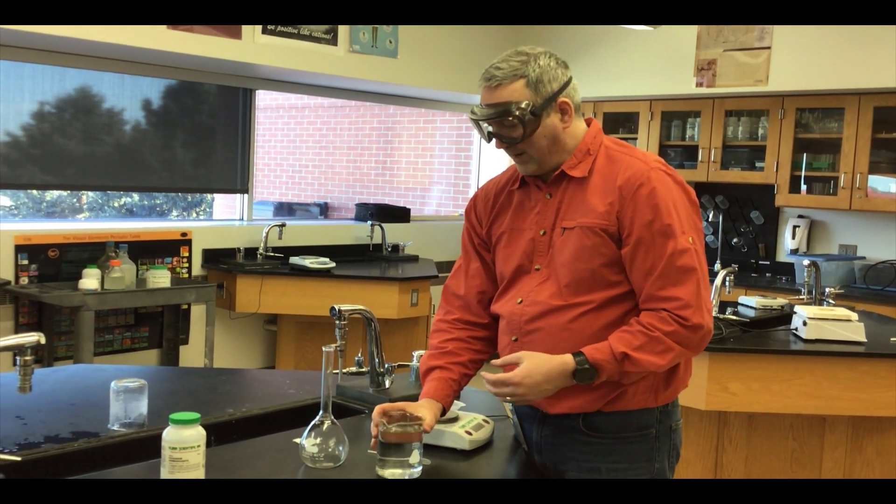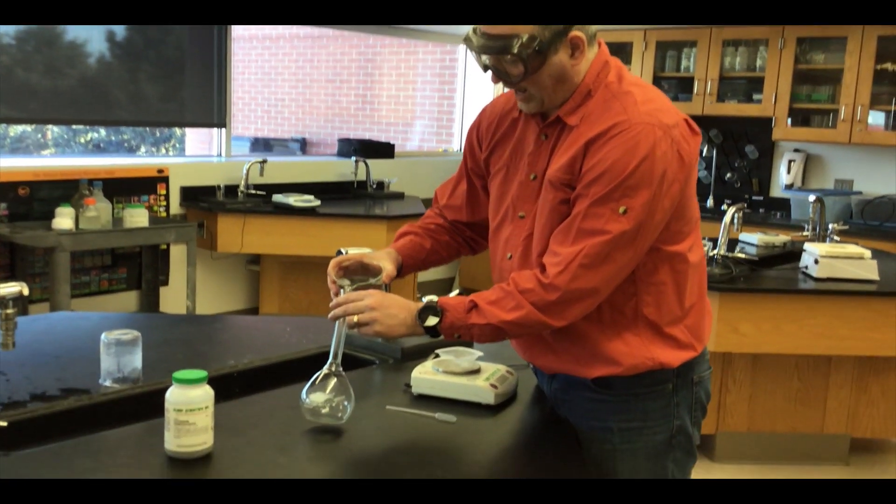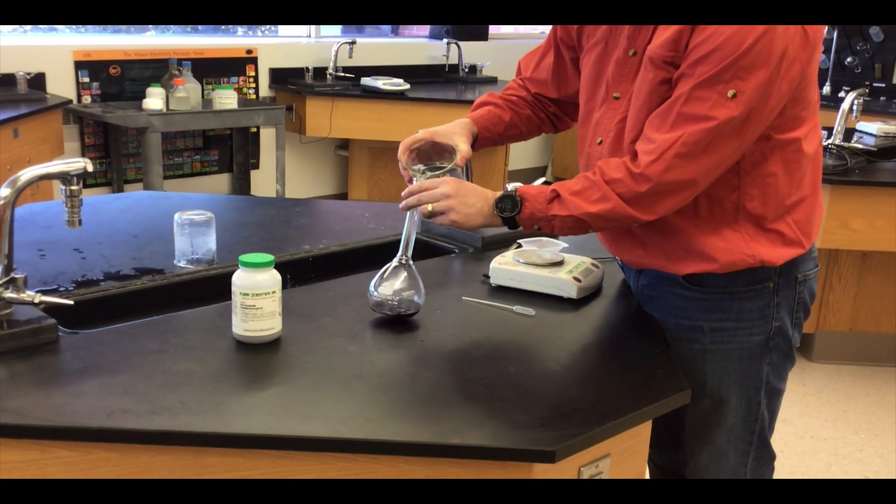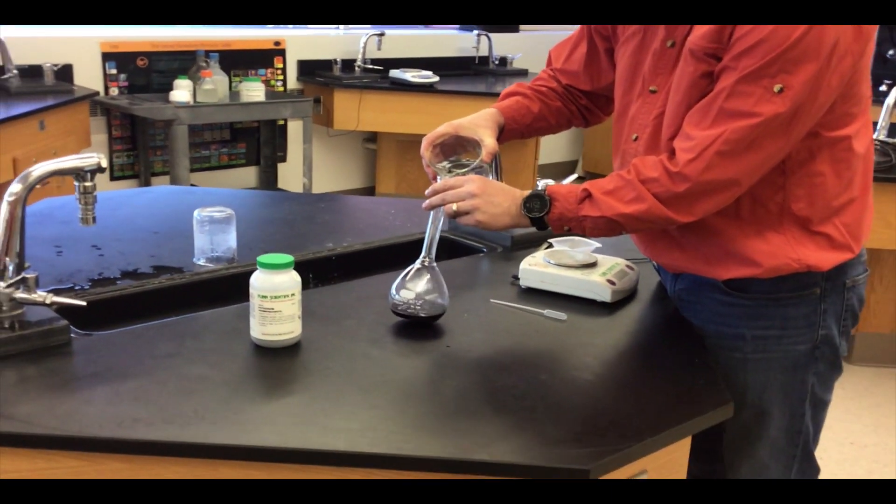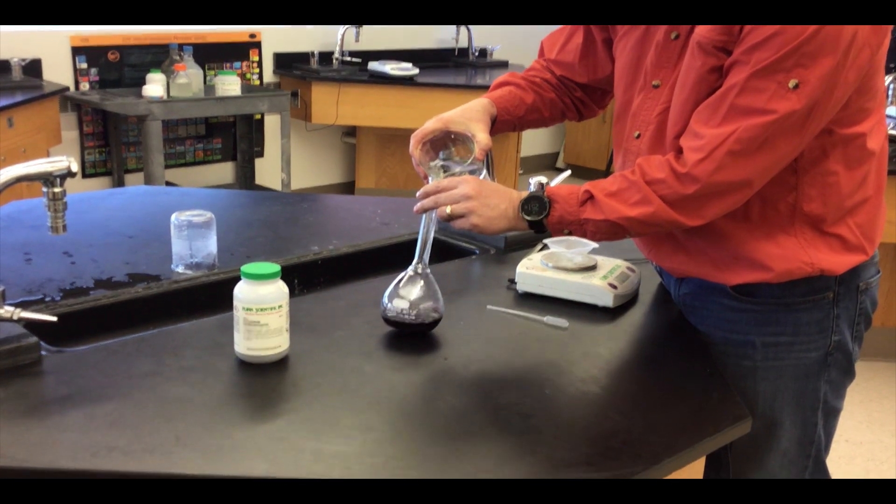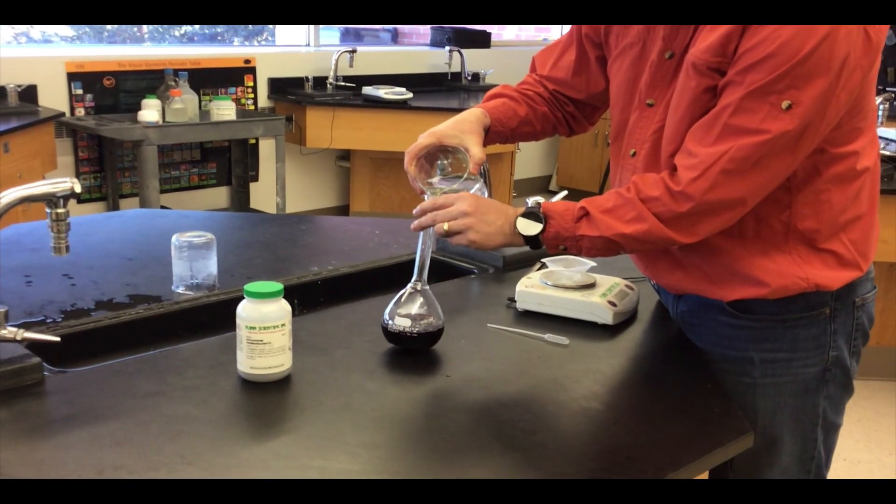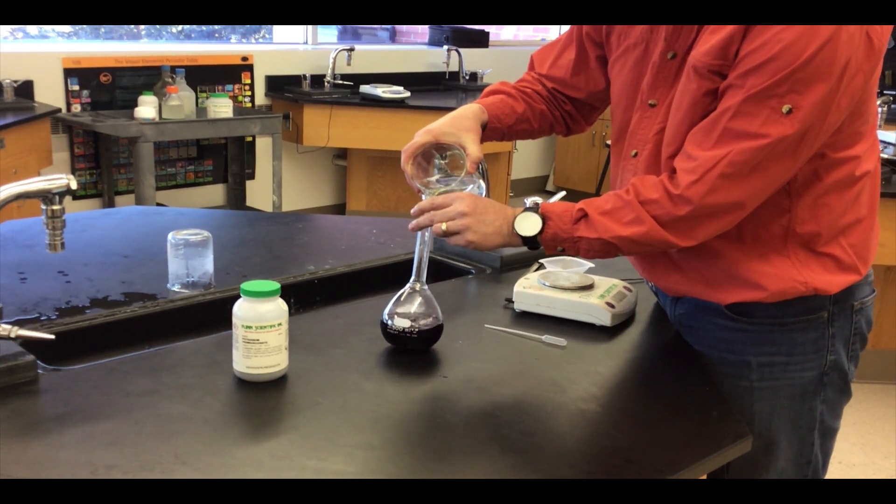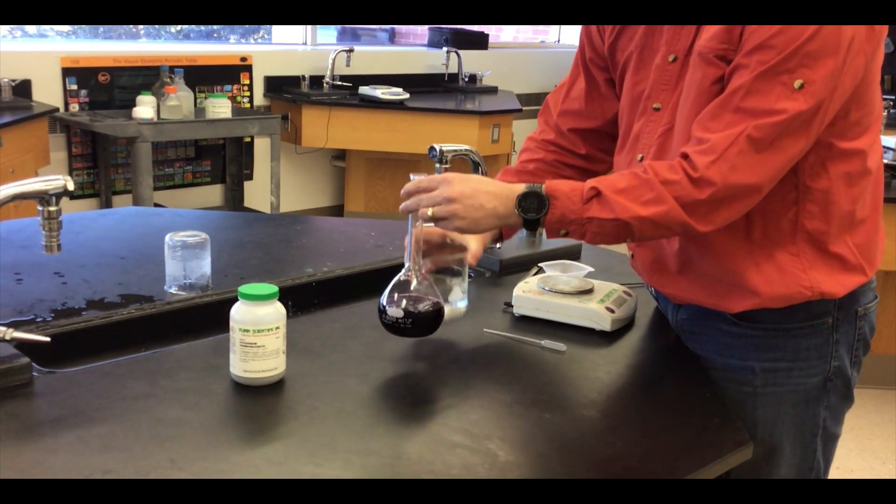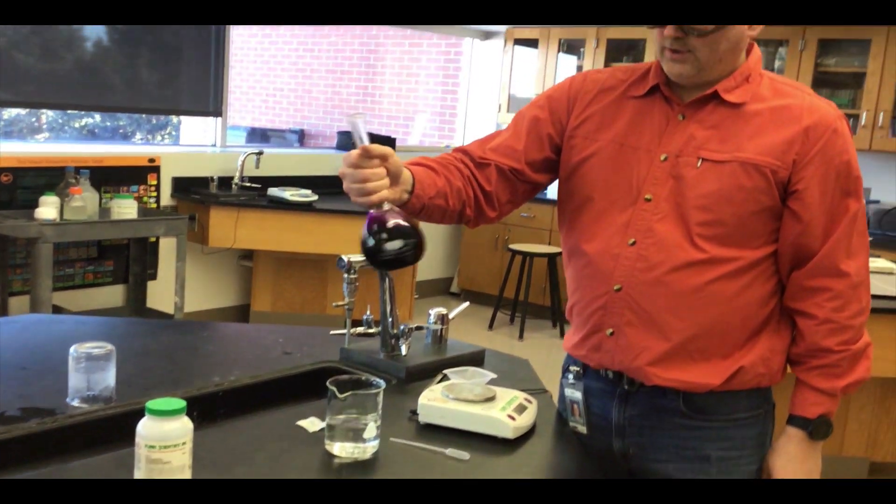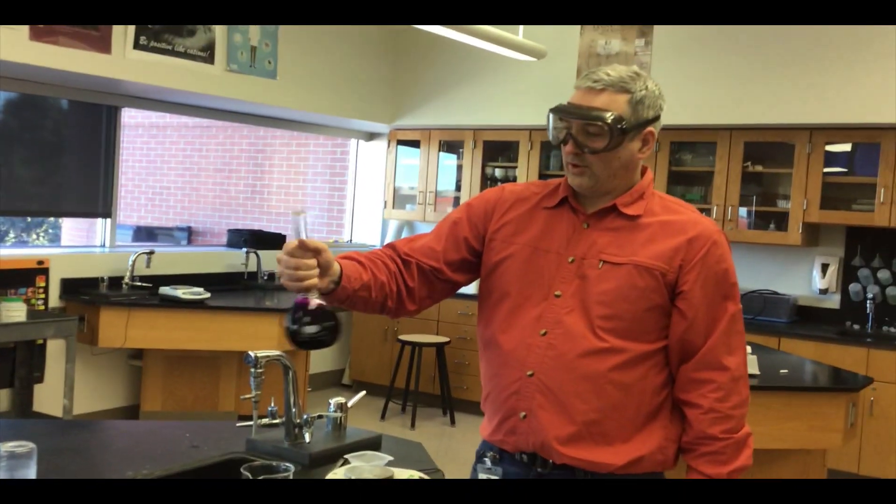So we're going to mix it first by adding some of this into the flask. It's a nice purple color. We're going to add enough in there so we can still swirl it around, so about halfway up, and then we're going to swirl it and make this solution.